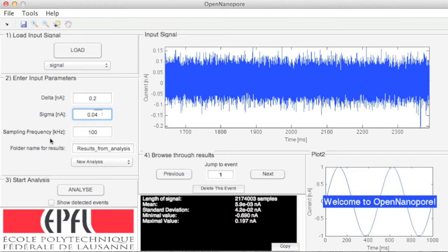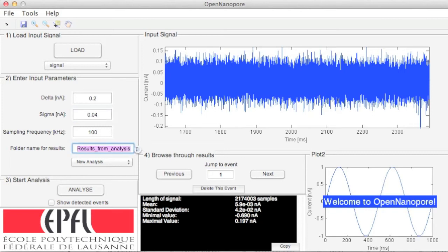Next, sampling frequency is the rate at which your ionic current trace was acquired. Enter the value in kilohertz. Then, give a name to the results folder, and click on the Analyze button to start analysis.